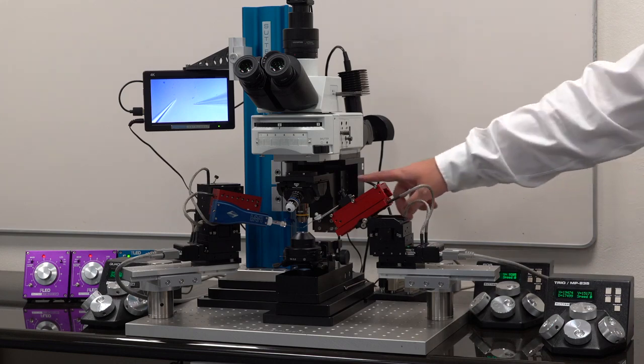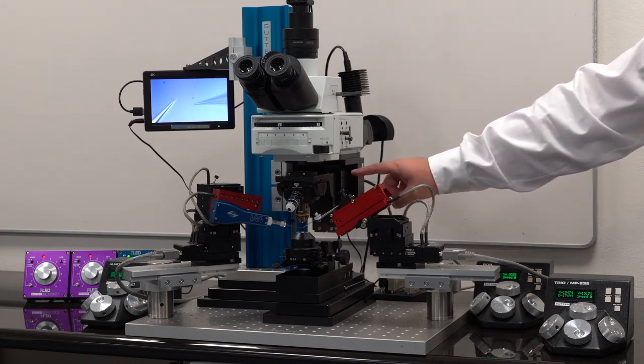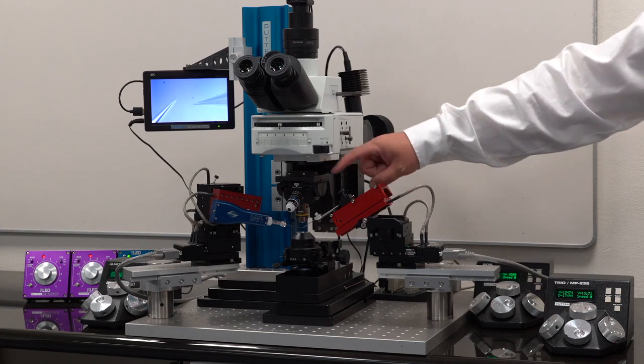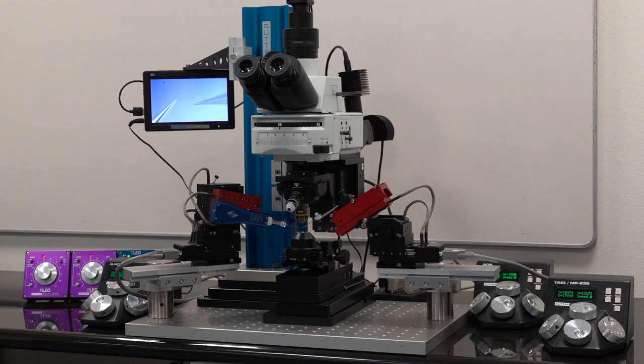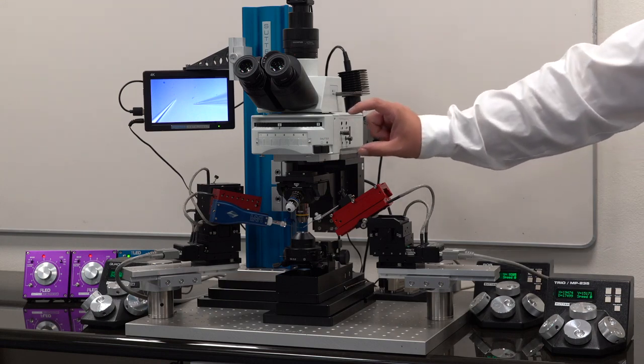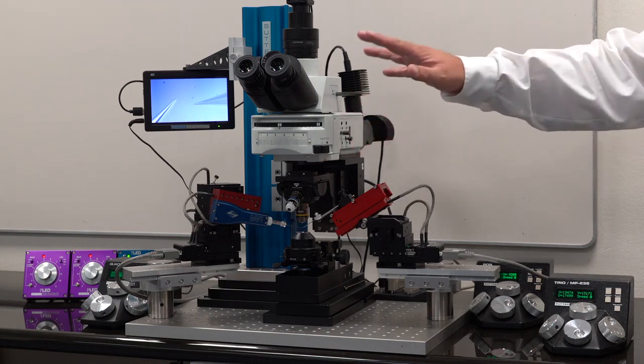Within the core is the 25mm of Z-focus, which moves the Olympus focusing arm and two-position swinging nose piece. Also moves up and down is the epiluminator itself and the Trinoc.